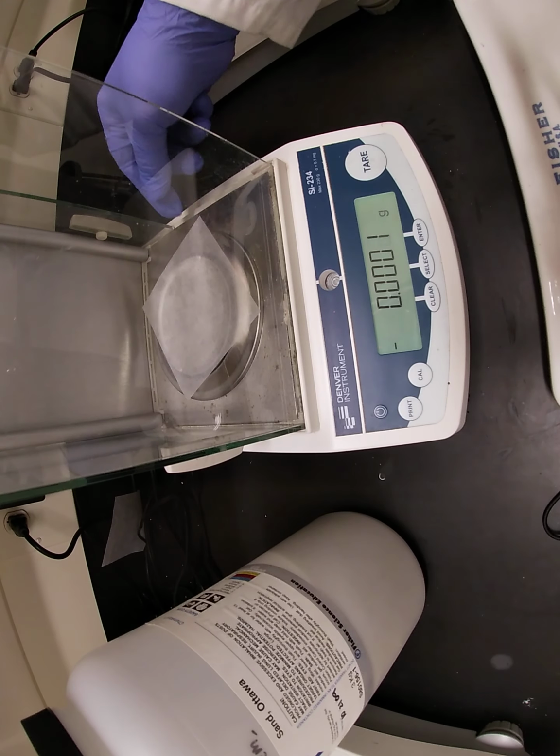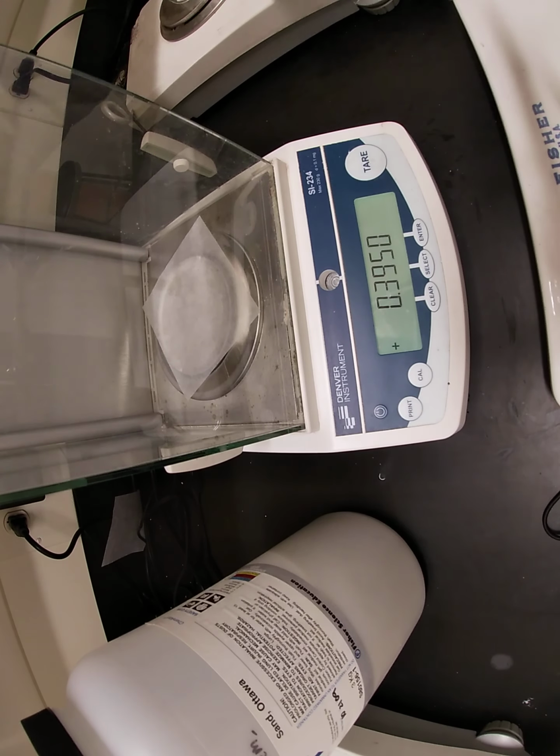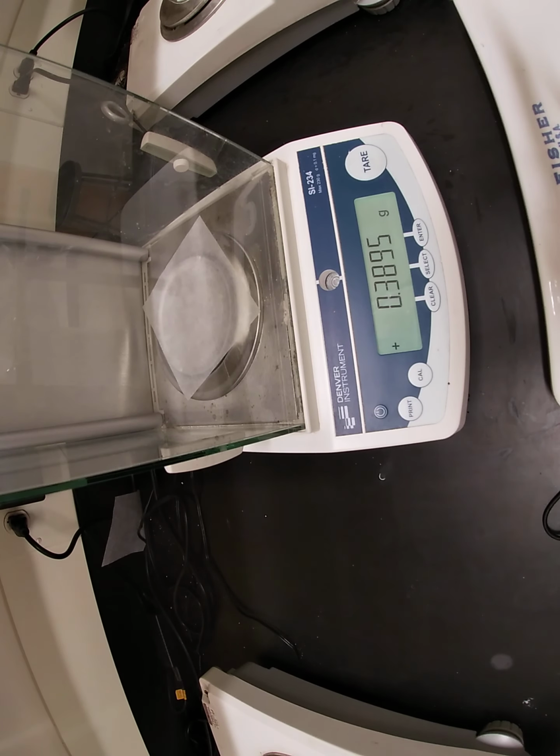And finally, one more piece of weigh paper as we close up, and we'll add our last ingredient. Another crystalline substance, crystal-like substance, if you will.